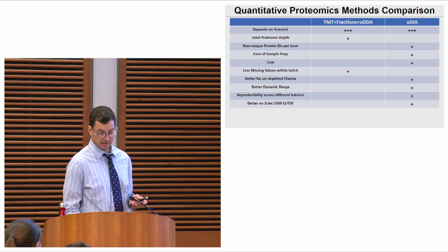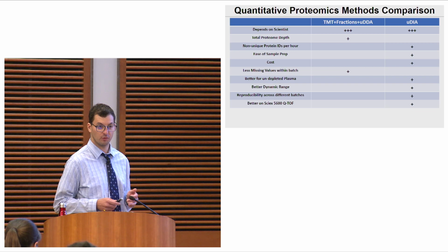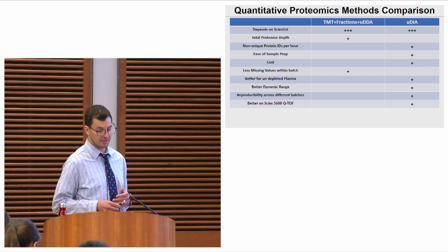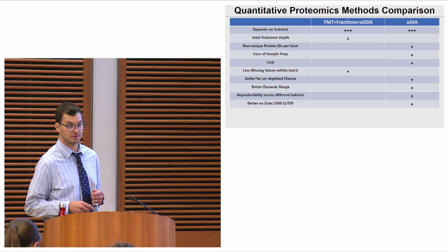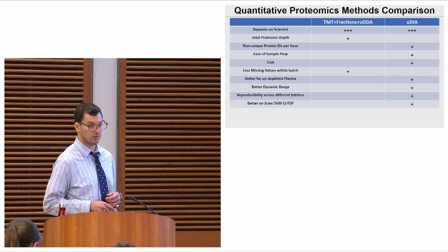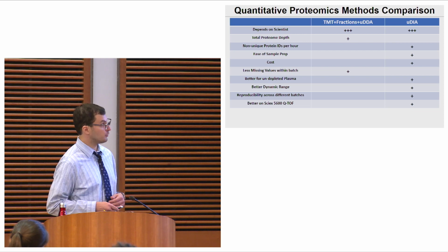And then this is the last slide. I'd like to finish with a comparison of the strengths and the weaknesses of each method. And this isn't just my opinion. I went to Twitter and I asked people who are practitioners in the field and have performed both methods, and I wanted to see what they thought. Overwhelmingly, the first thing that people said was it really depends on the scientist that's doing the analysis and the equipment that they have. So you should probably listen to your core. If they say we're not good at that, listen to them.